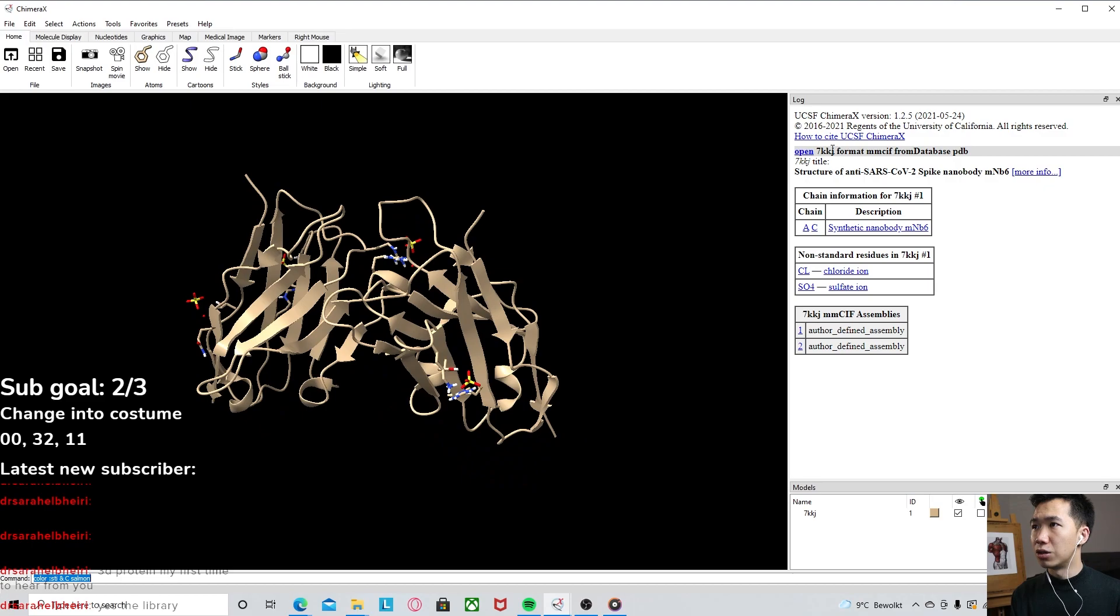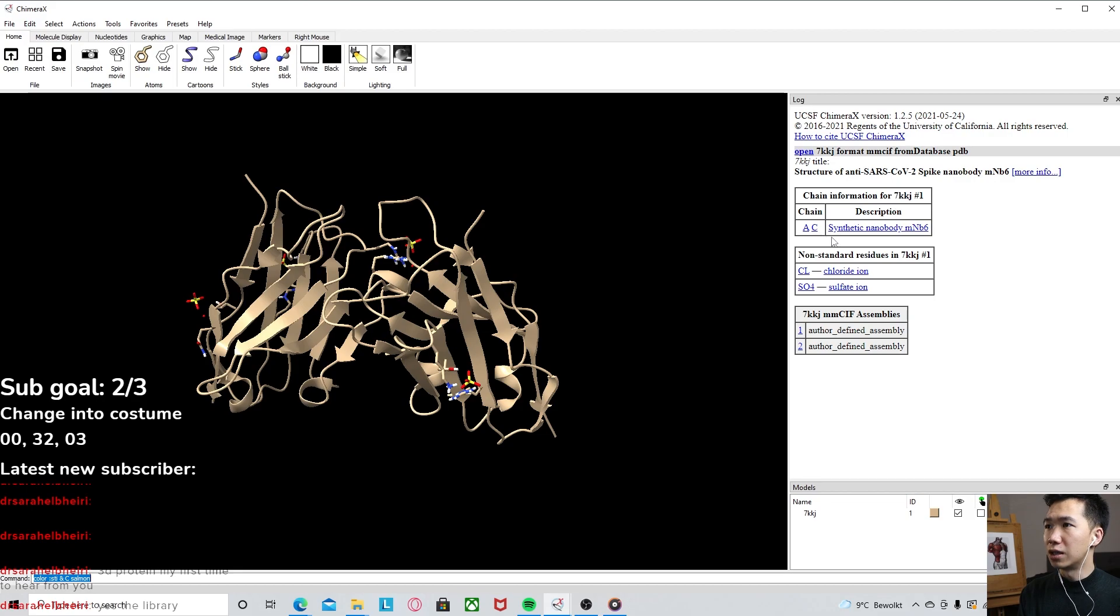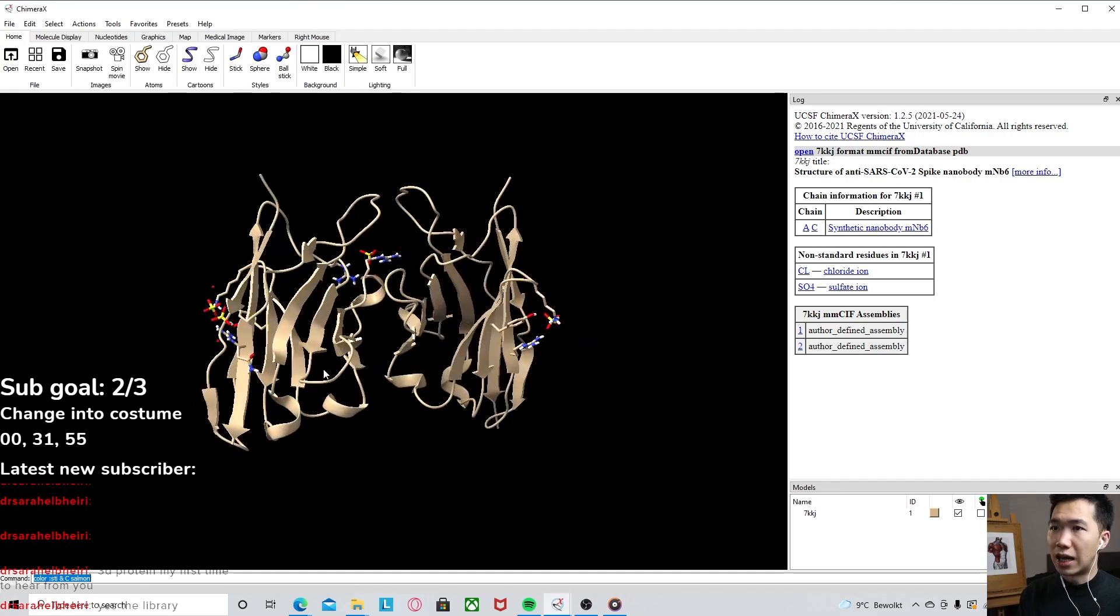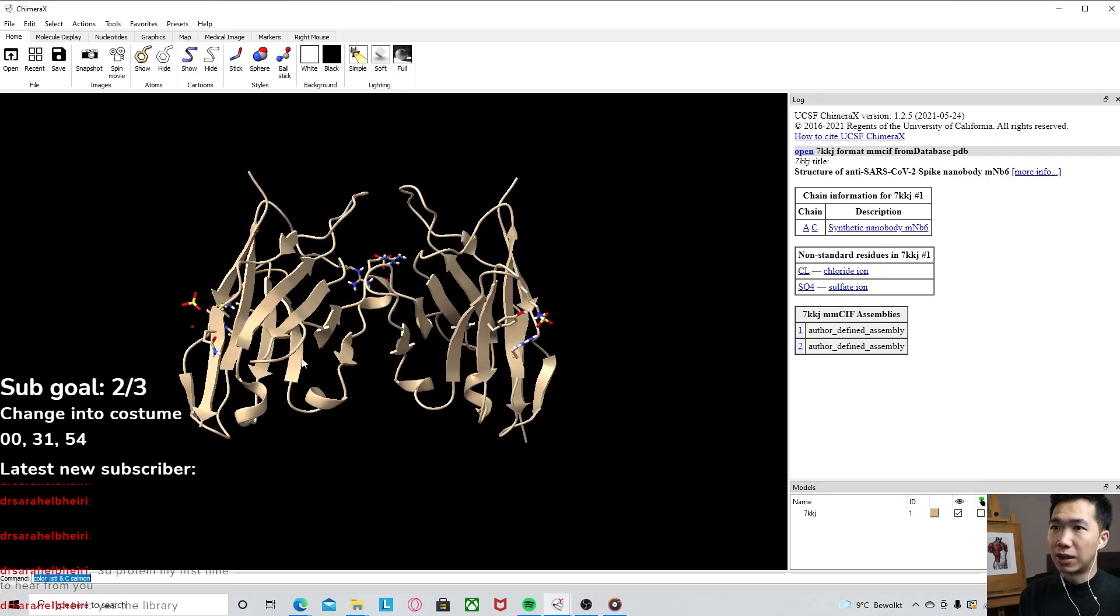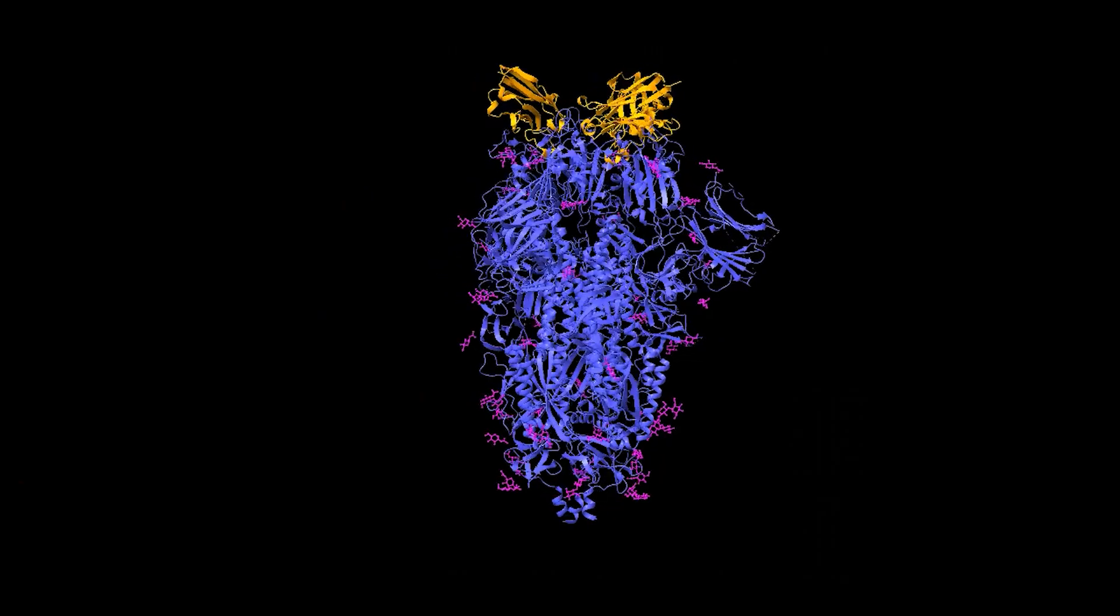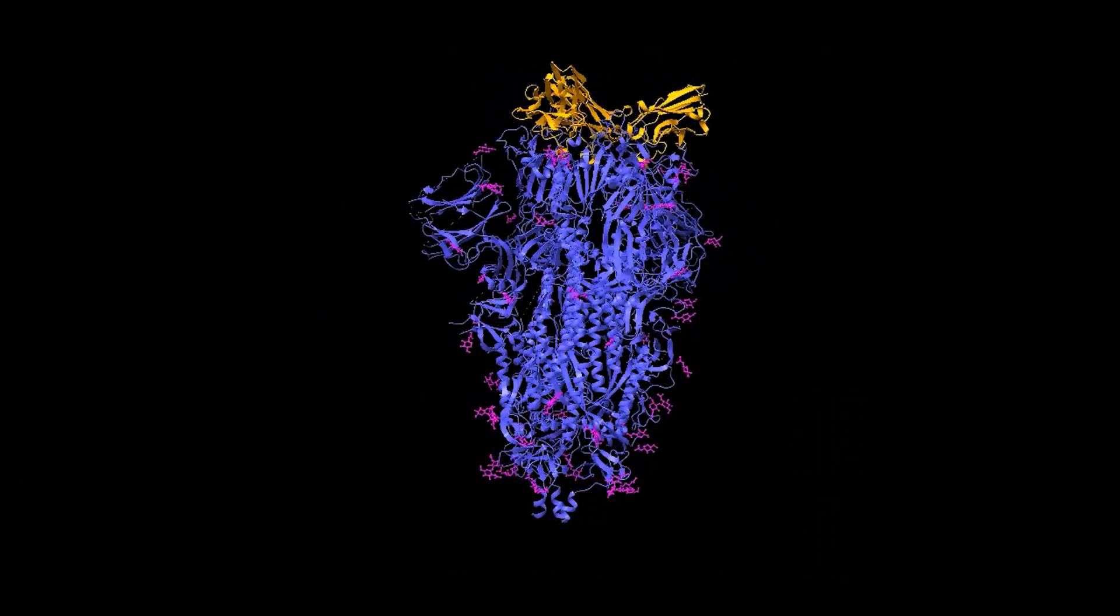And here it also tells you what this protein is. 7kkj is the synthetic nettle body. This is that antibody that we see that was on top of the coronavirus spike protein.